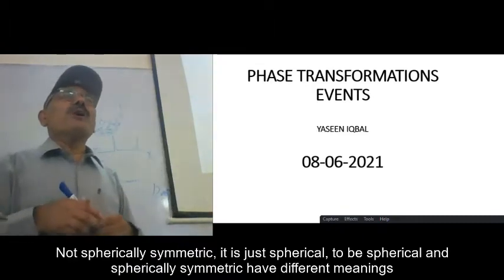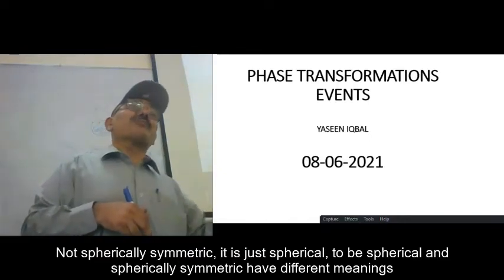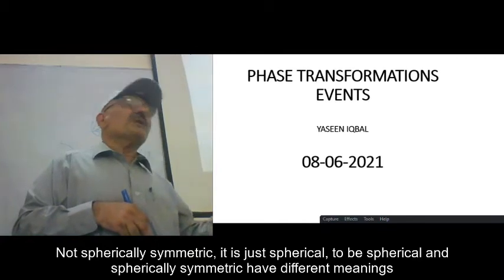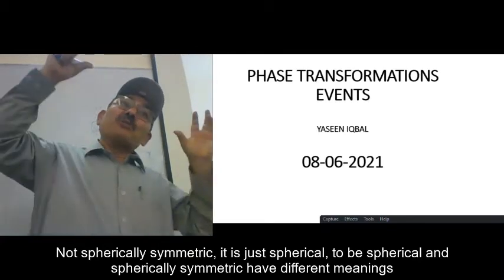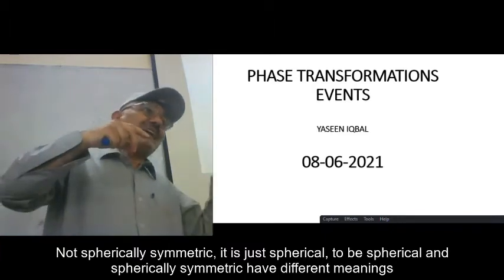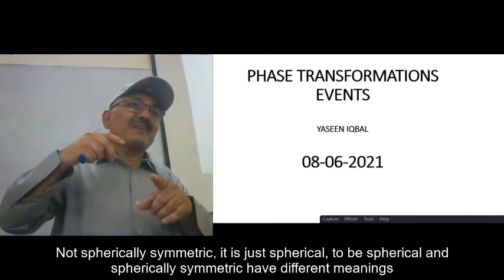Thirdly, don't heat the material at such a temperature where volatilization occurs. So this is the job of the scientist, to make a compromise between the quality and the energy, right?